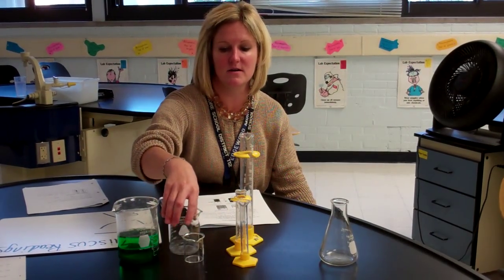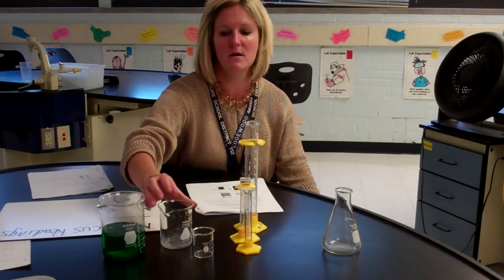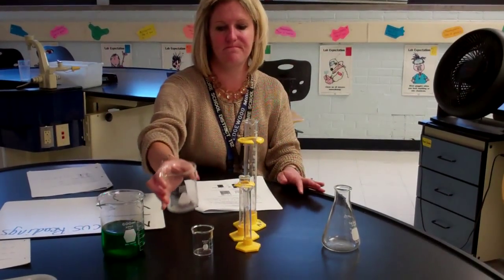So over here are the beakers. We have a 600 milliliter beaker, a 250 milliliter beaker, and a 50 milliliter beaker. These are pretty much the standard ones we'll be using this year. The great thing about the beakers is they do have a lip for careful pouring.